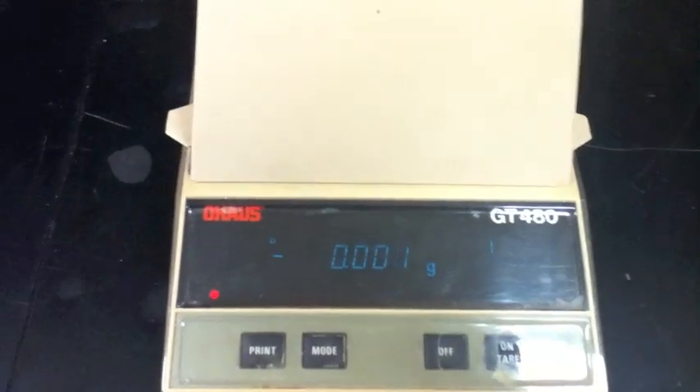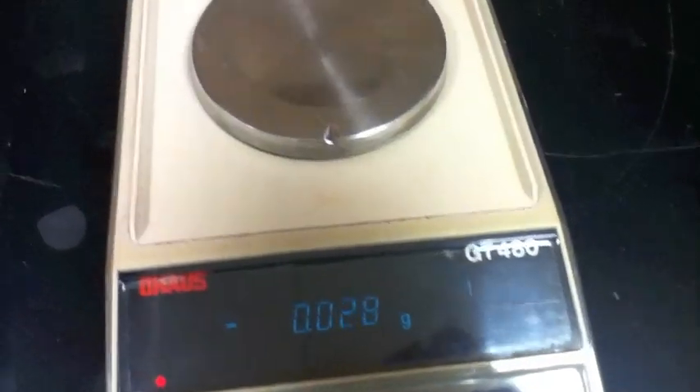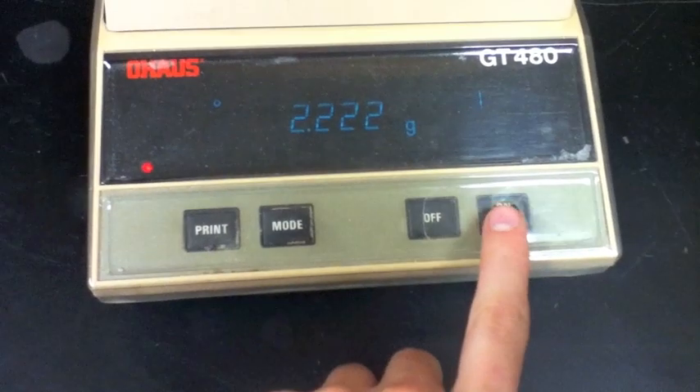In this demonstration, I'm going to obtain the mass of a paperclip. But before I can obtain this, I must first zero out the weigh boat, which itself has mass. I'll start by placing the weigh boat on the digital balance, closing the lid, and then pressing the on/tare button to zero out the mass of the weigh boat.